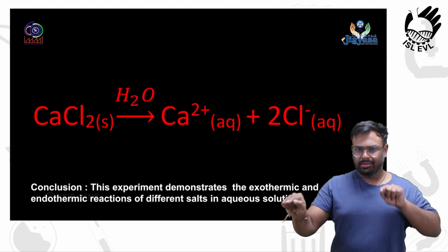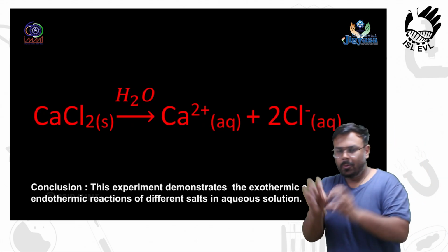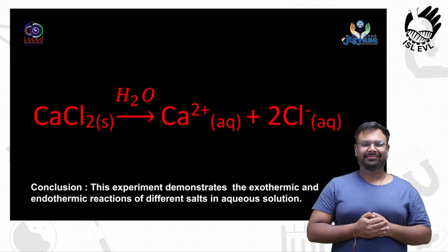Conclusion: this experiment demonstrates the exothermic and endothermic reactions of different salts in aqueous solution.